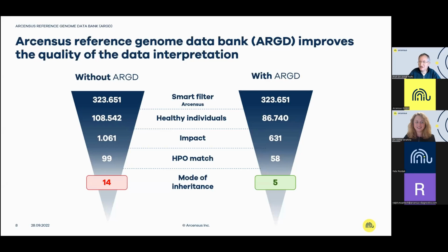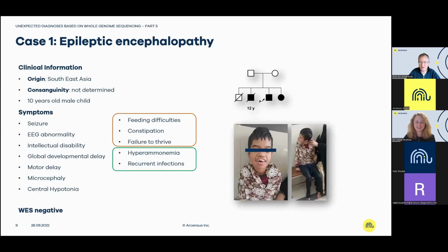So this is modern technology, and this is the way we would like to see molecular genomic medicine positioned in the next years. So allow me to demonstrate a case to you. I've shown some further webinars before, only in part, but with this case, you get an even better insight into how we are implementing the different steps in the interpretation of the data we are generating based on the genome.